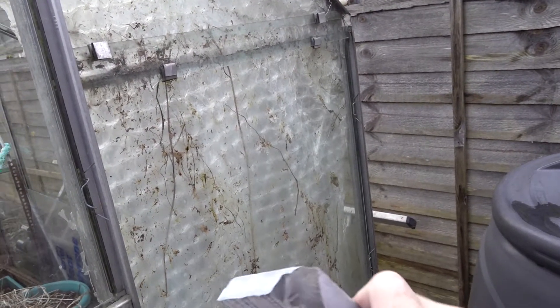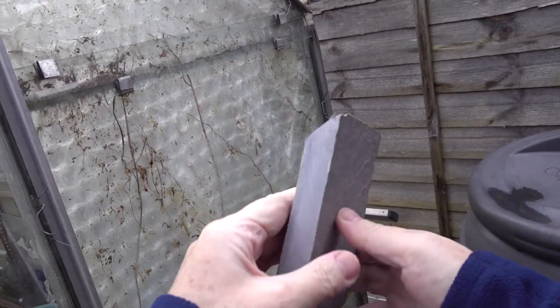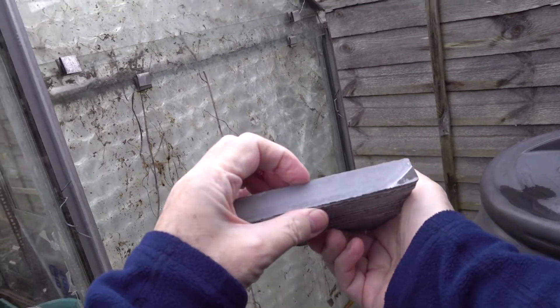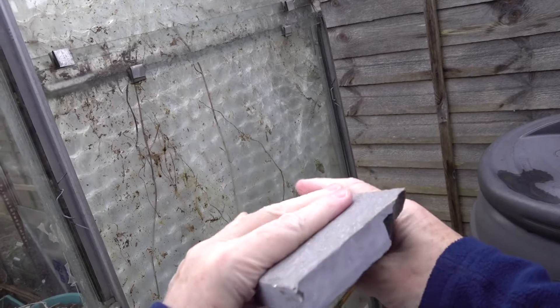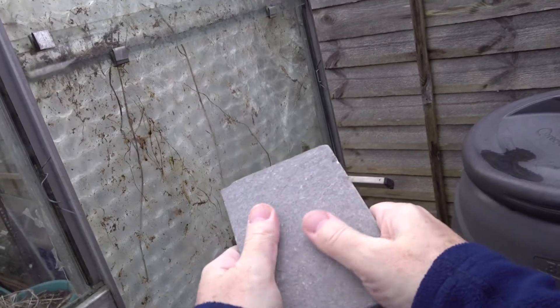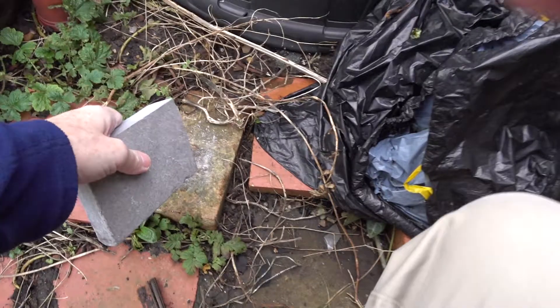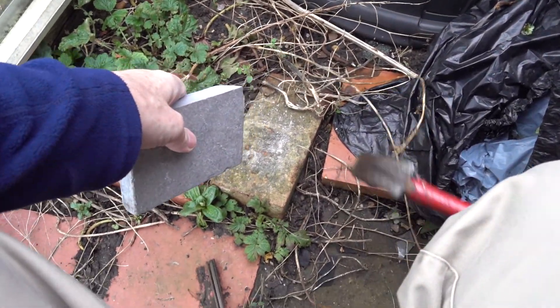In this greenhouse chemistry demonstration, we have a sample of a limestone floor tile, about one and a half centimeters thick. It has a nice smooth limestone feel to it. Let's see what happens if we try to break a few chips off the rock with the hammer.